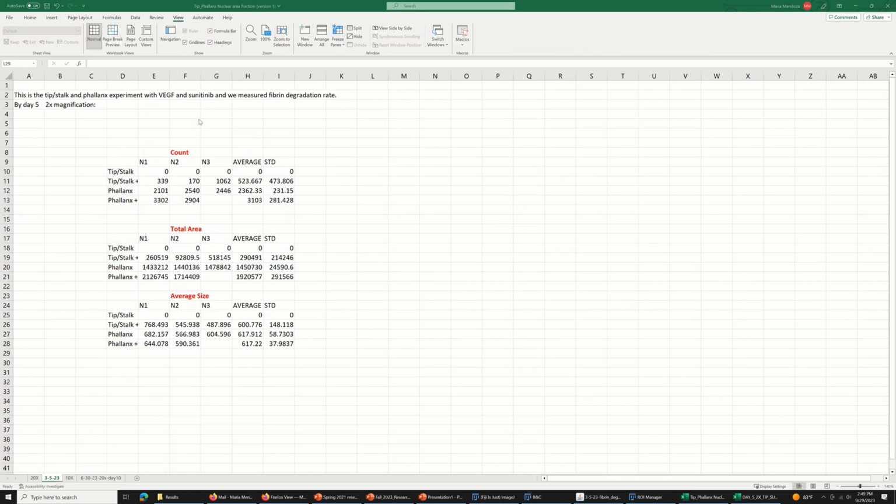Okay, I brought you in a little bit closer. Now we're going to go ahead and start making our graphs. So what I'm going to do is I'm going to take, copy, I'll put it right here. This, and then we'll just take our average. Actually, I think we have to take our average and our standard deviation. Put it here, and then click here, press.